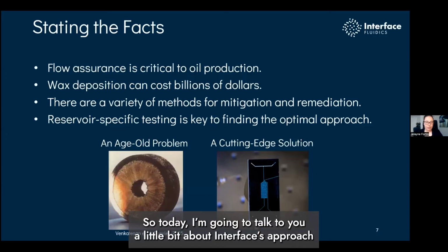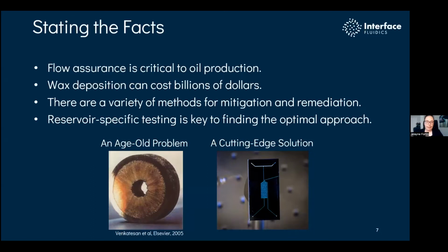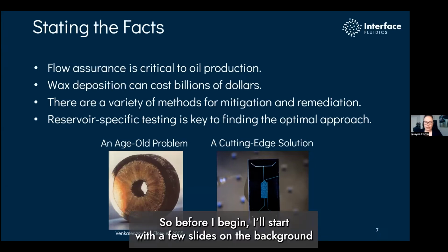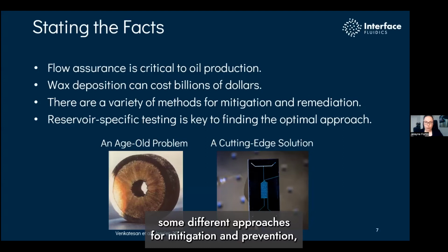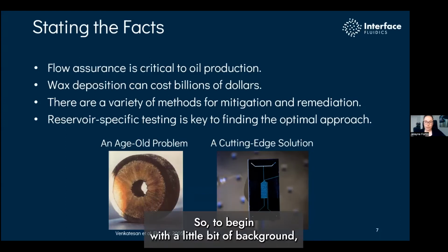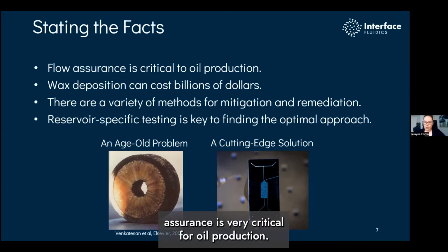So today I'm going to talk to you a little bit about Interface's approach to testing wax appearance temperature, as well as some of the other ways that we approach the wax problem. So before I begin, I'll start with a few slides on the background to this problem, how it impacts the oil and gas industry, some different approaches for mitigation and prevention of this problem, and then go into Interface's specific offerings.